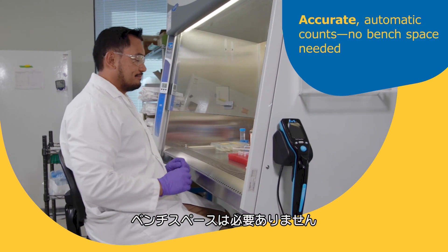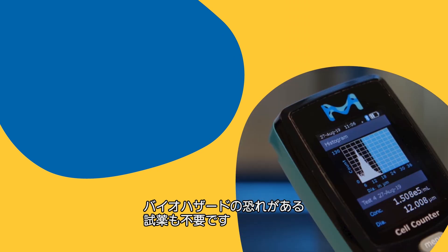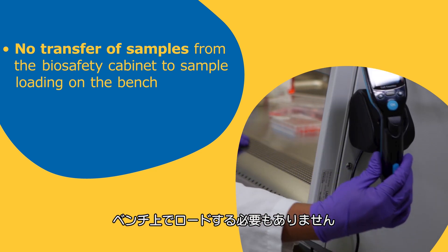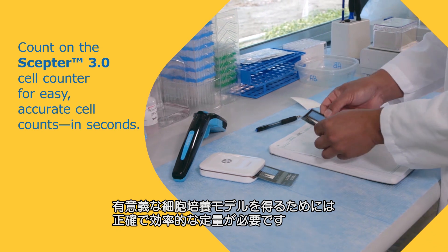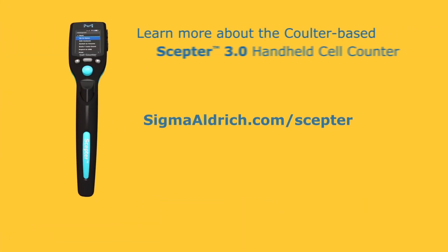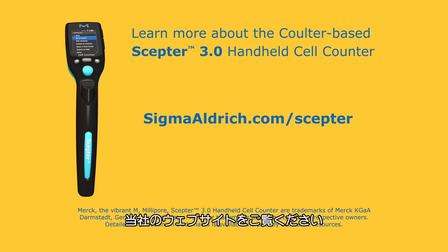Unlike other automated counters, the Scepter 3.0 counter requires no bench space, needs no additional and potentially biohazardous reagents for operation, and no transfer of samples from the biosafety cabinet to sample loading on the bench. Meaningful cell culture models require accurate, efficient quantitation. Count on the Scepter 3.0 cell counter for easy, accurate cell counts in seconds. Visit our website for more information and to order the Scepter 3.0 counter.